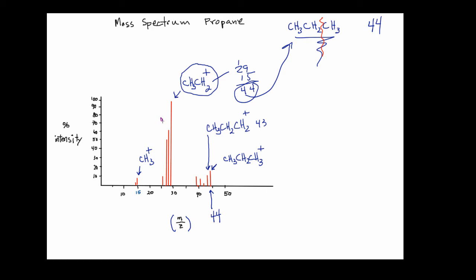All right, and similarly we can move down these peaks. So for example, this one right here, which has a molar mass of 28, is going to represent, let me just extend this a little bit so I have more room, it's going to represent CH3CH, all right, for a total molar mass. And you can do the same analysis as we move down here, and you can figure out each of these peaks, which I'm going to leave to the student to figure out.